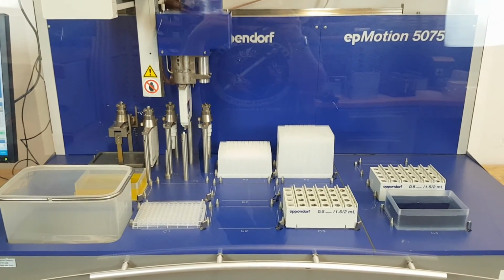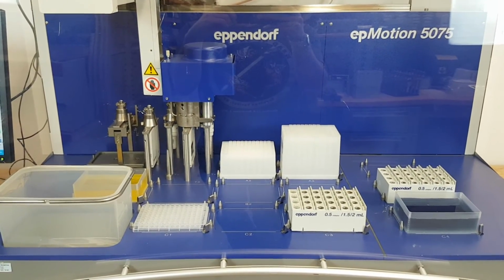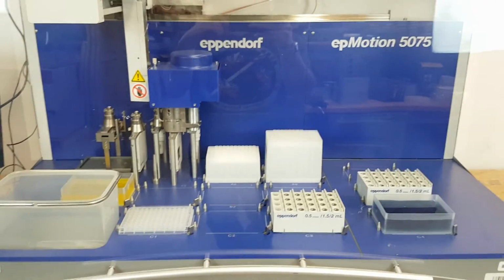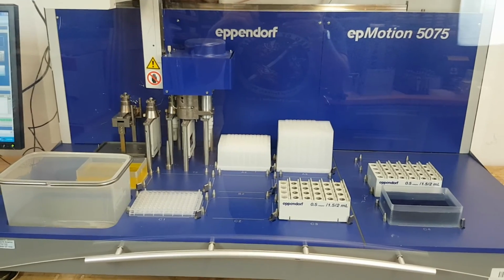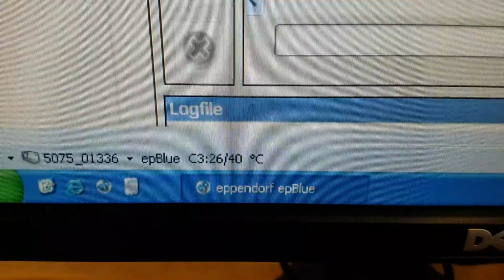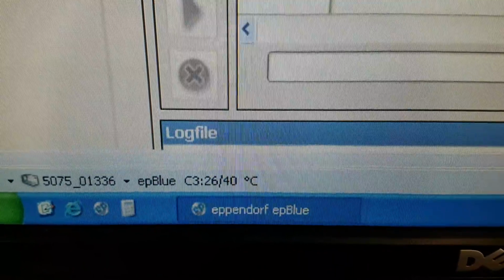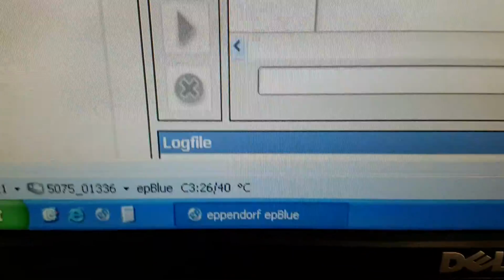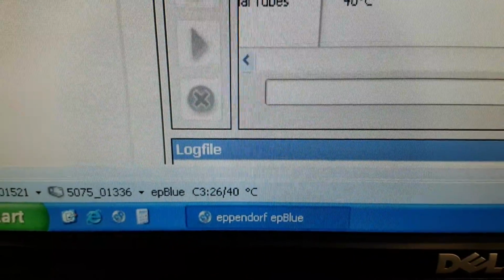Okay, it's gonna put that down, and the final instruction is to wait for the 40-degree temperature. We'll check back in and show you where the temperature has reached. It is at 26 degrees. We can keep watching it for a few moments, see if it is going up. And that will conclude our demonstration.